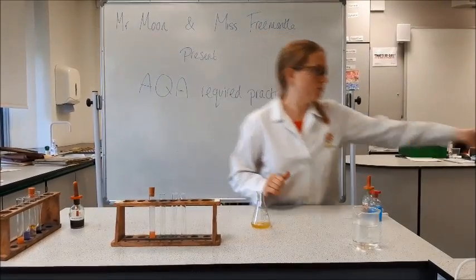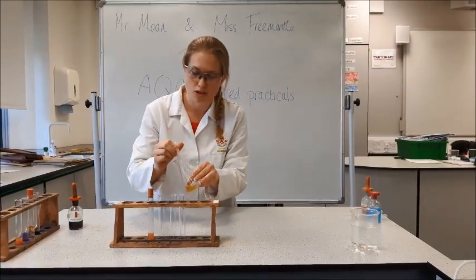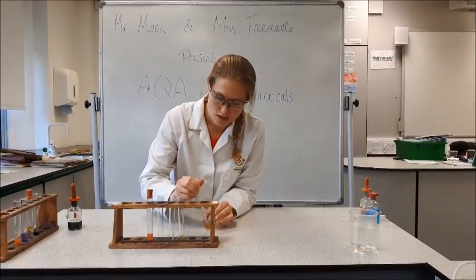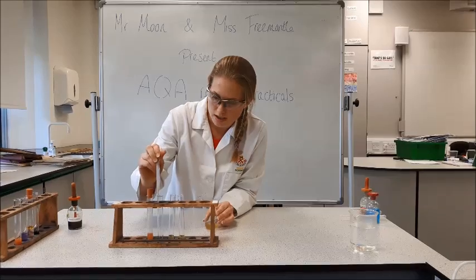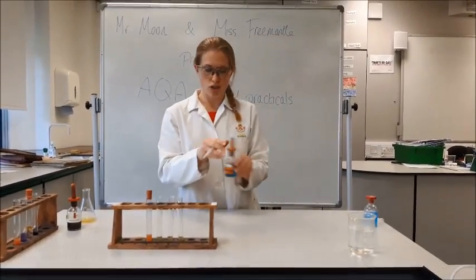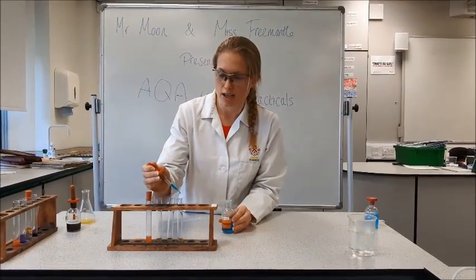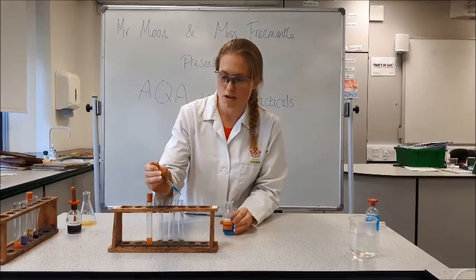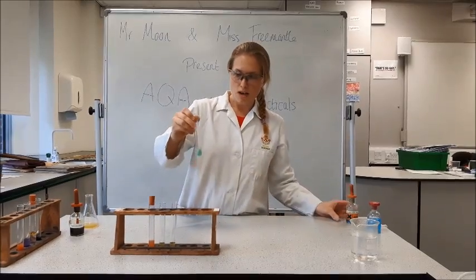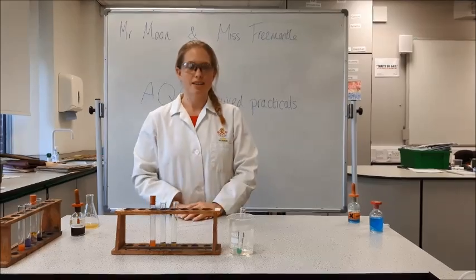I'm going to put the filtrate into test tubes — a round of each. Then I'm going to test for reducing sugars first, so I'm going to add Benedict's solution — ten drops as the instructions say. A little swirl, and into the water bath. We'll leave that there to see what happens.